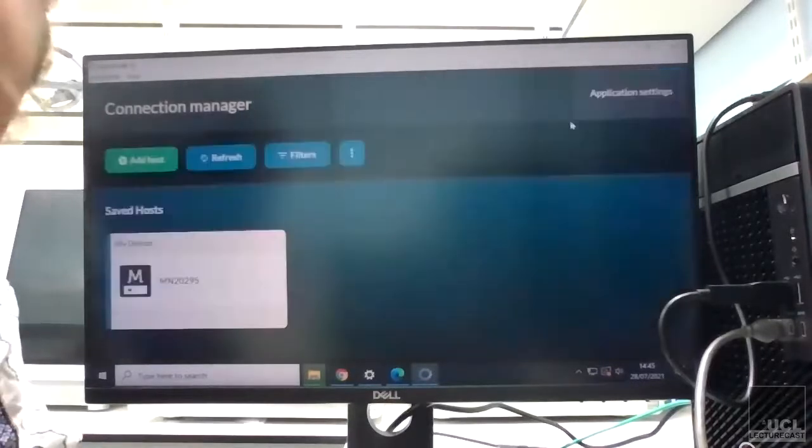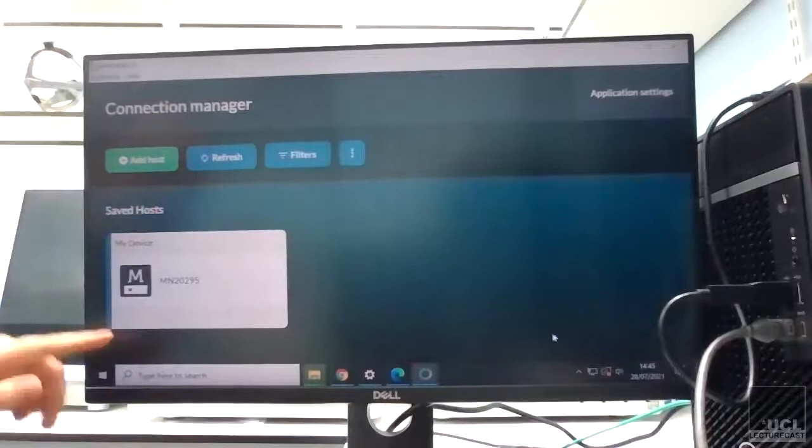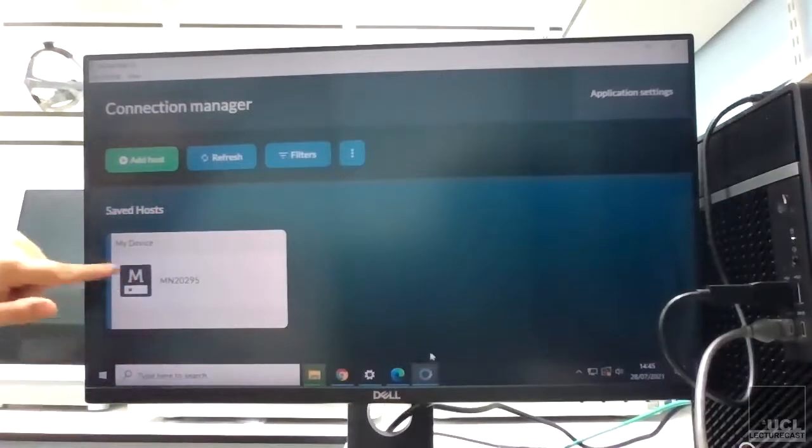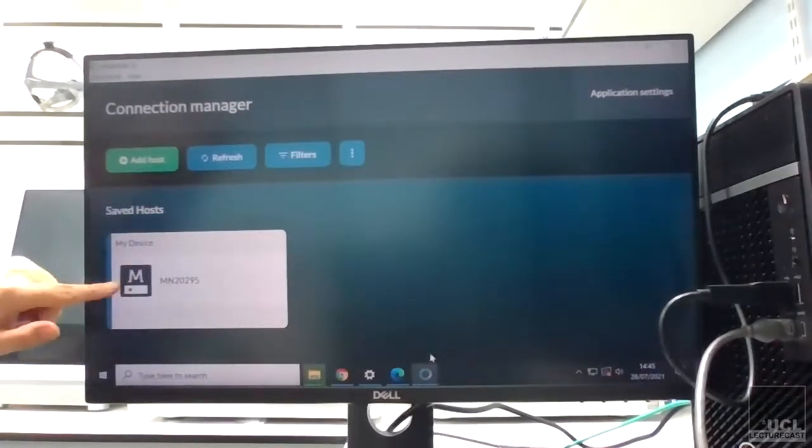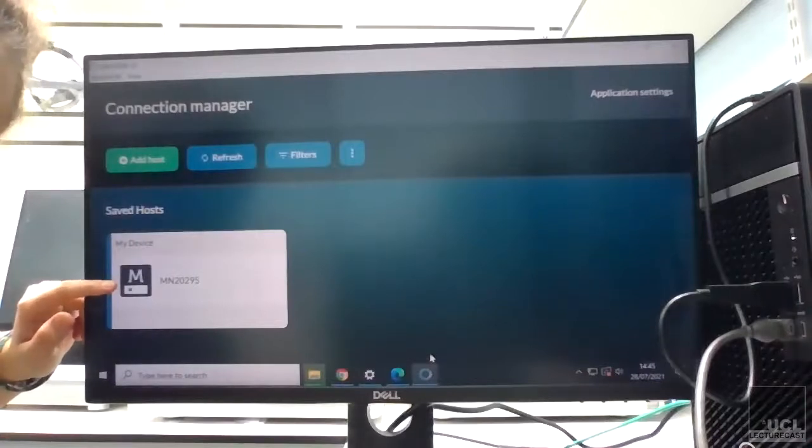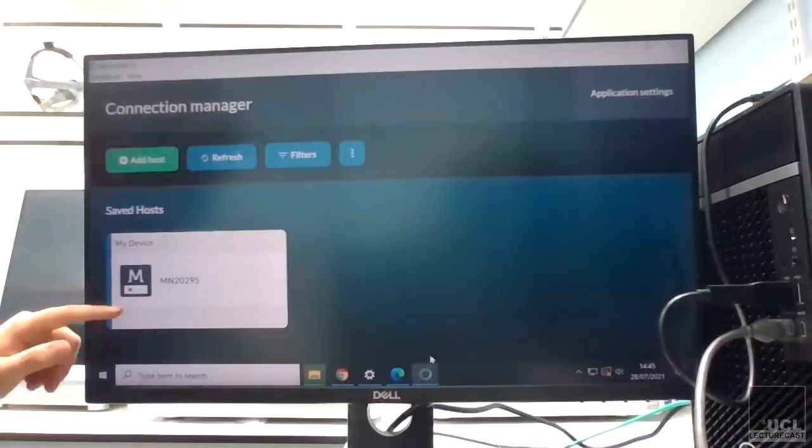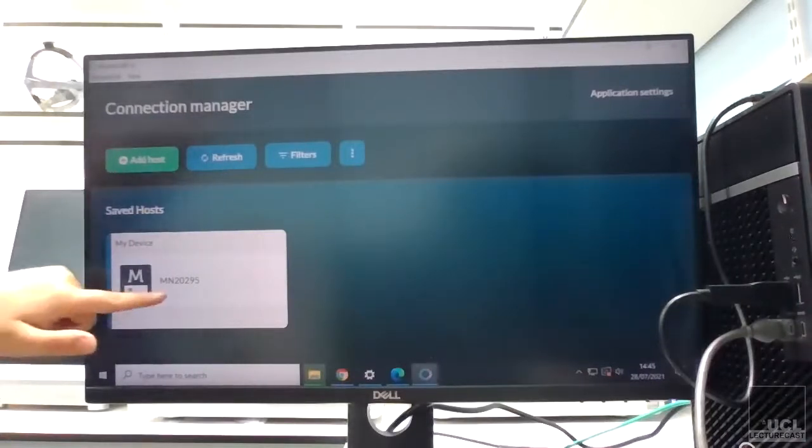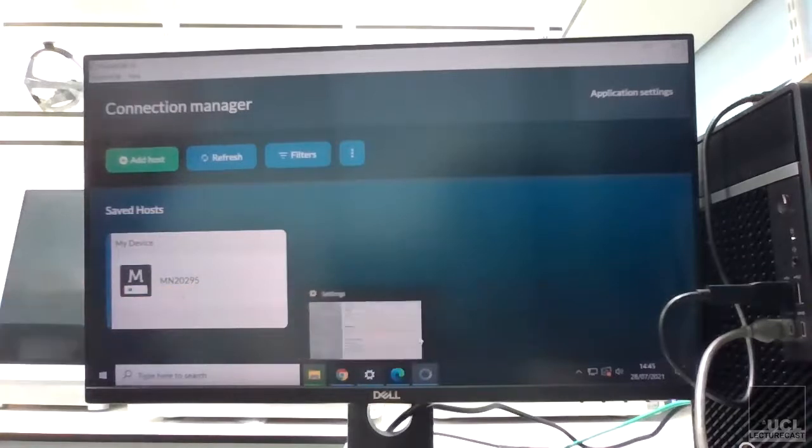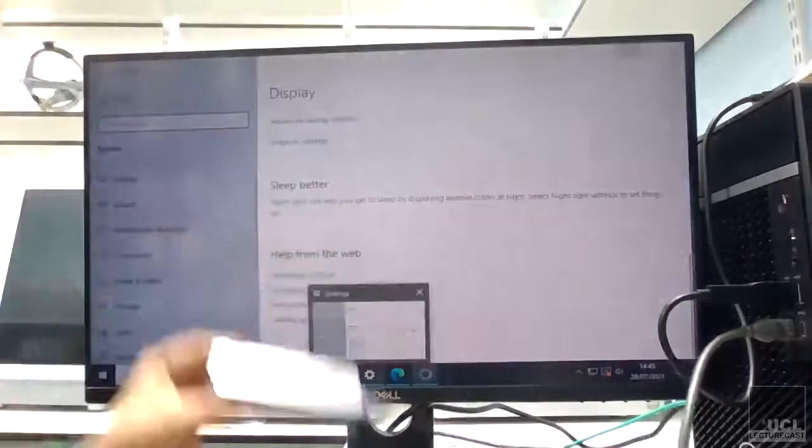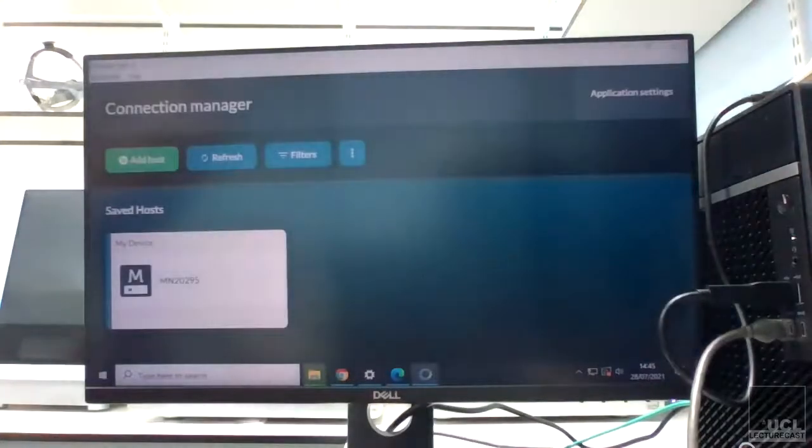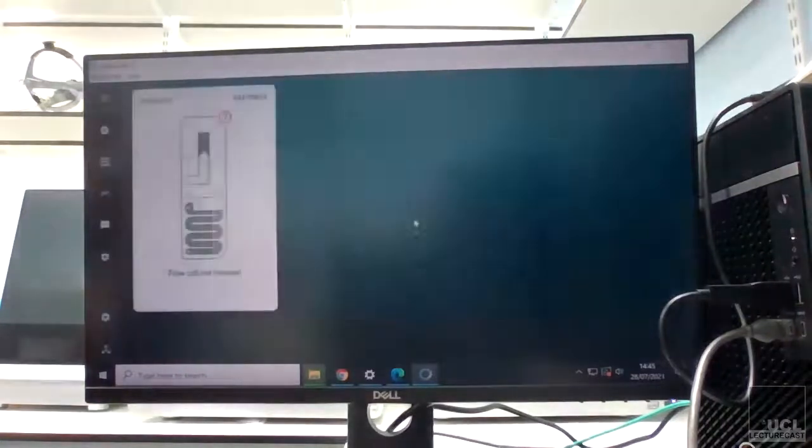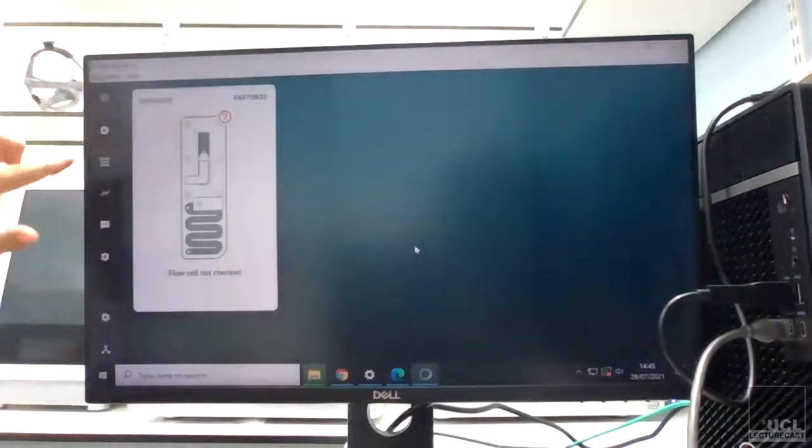So what you should see is over here it says 'My Device'. I guess on the Mark 1C it will already know what the device is because it's attached to it, but here this is the number of my flow cell. So I just need to click on that.